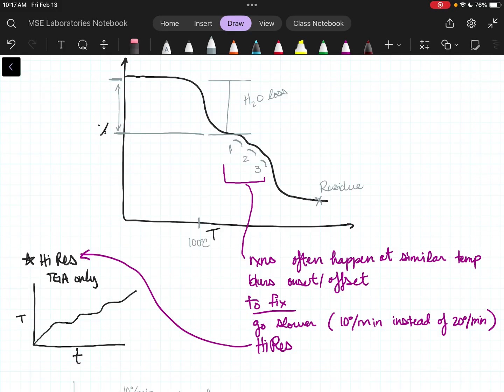And then continuing on our graph, we get this final value. We obviously have like some big, like I think 3 probably continues all the way down to here based on what I'm seeing. And you can do any combination of derivatives on this line to make those peaks a little bit clearer. People will do first and second derivatives so you can really tell where the slope is changing between 1 and 2 and 3. And does 3 continue here, or is there maybe another one in here? Because it tells you concavity, and then you can say, oh, hey, it just starts being concave down at this point, not level. Exactly. Yep.